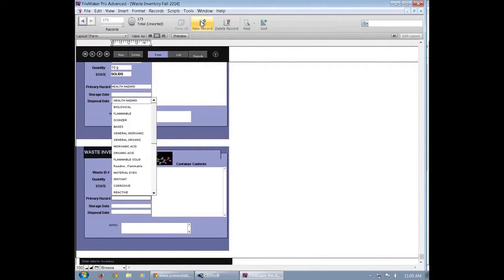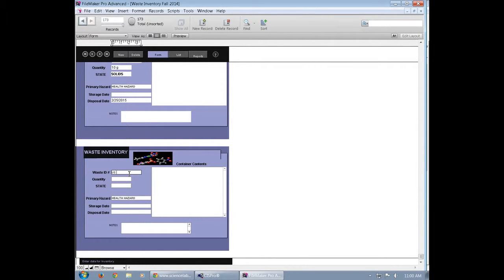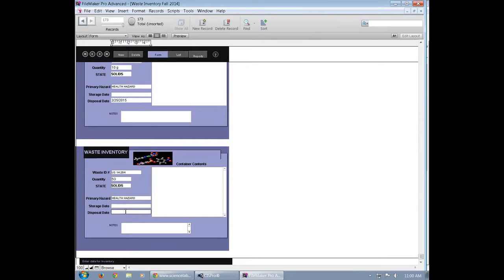The first thing it's going to prompt you for is the primary hazard. You can get that off the MSDS sheet. Now you're going to enter the waste ID number, which can be either gotten from the chemical above or off the whiteboard. In this case it is US14264. The quantity of the chemical you're wasting, what state the chemical is in, and then the date that you're disposing of the chemical.